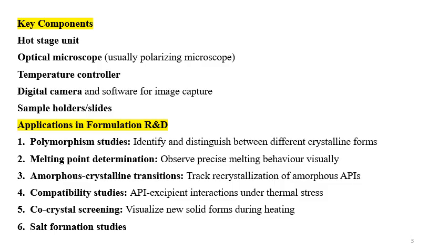Key components of the HSM are the hot stage unit, optical microscope, temperature controller, digital camera, and software for image capture and recording of the image, and sample holders or slides. Now we'll see the applications in formulation R&D. Polymorphism studies are done, melting point determination, amorphous crystalline transitions, study of compatibility, co-crystal screening, and salt formation studies. These are the applications of HSM.